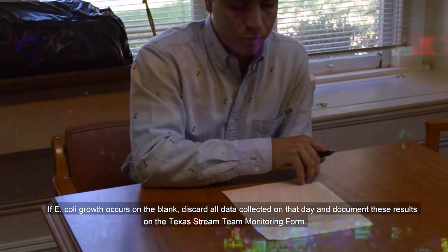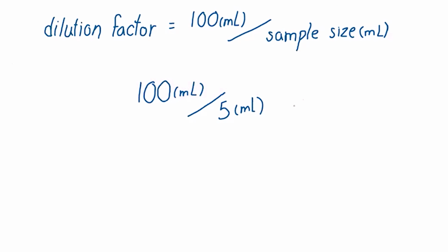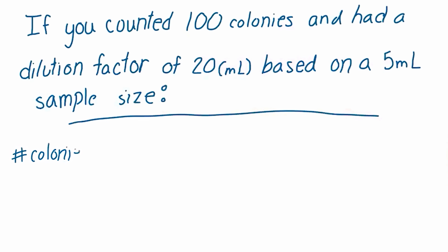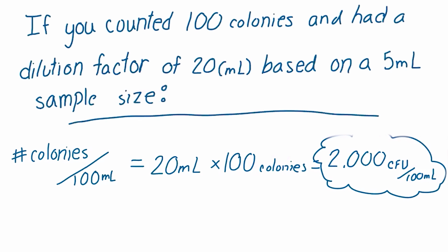In order to get the final results, a series of calculations must be completed. First, you must determine the dilution factor for each petri dish. The dilution factor is calculated by dividing 100 milliliters by the sample size. Since we drew a sample size of 5 milliliters, your dilution factor is 100 milliliters divided by 5 milliliters equaling 20 milliliters. To determine the number of colony-forming units per 100 milliliters, if we counted 100 colonies and had a dilution factor of 20 milliliters based on a 5 milliliter sample size, a final result is calculated by multiplying the dilution factor of 20 milliliters by the 100 colonies counted to equal 2,000 colony-forming units per 100 milliliters.